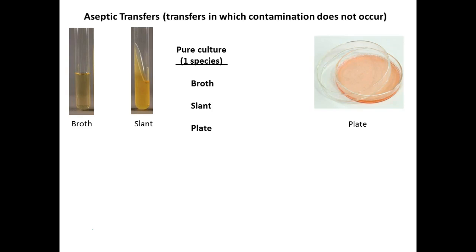Make sense? Okay. So today we have sterile media that I have set aside for you, warmed up in the incubator. It has no organisms in it, right? Sterile means no organisms at all. From your quiz last week, you remember what we called our plates that we didn't expose that had sterile media? What were they for our experiment? They were our negative control. Yeah, remember that? It's important.